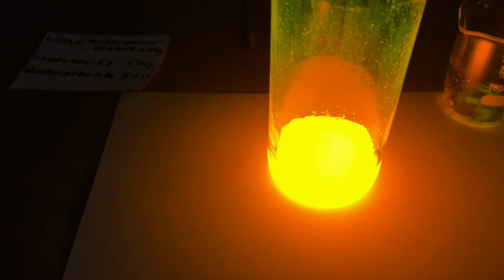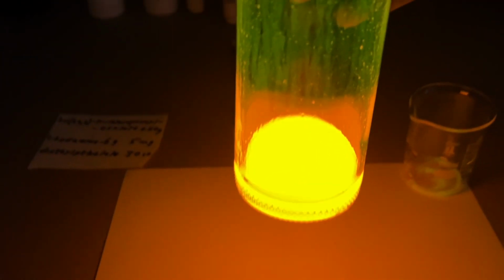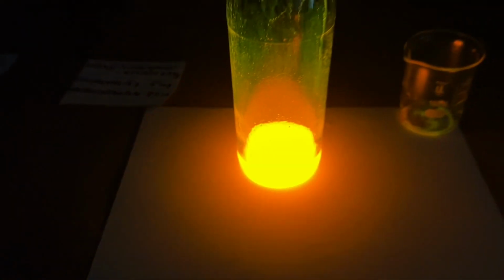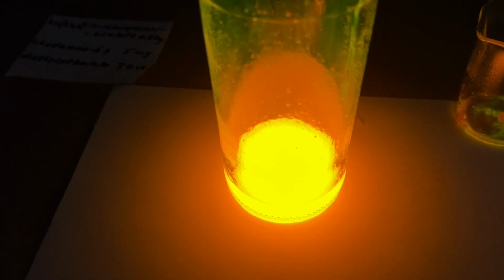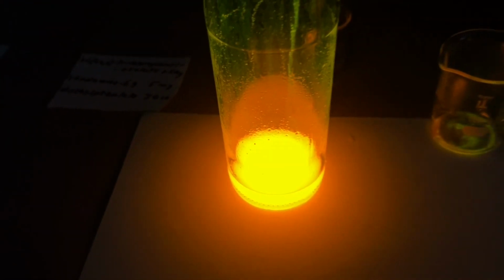And in fact, this reaction is used in the military and also in EMS to be able to help in emergency situations, because the reaction goes on for several hours where you've got light production, and it's usable light. So here's our chemoluminescence, which is technically phosphorescence.